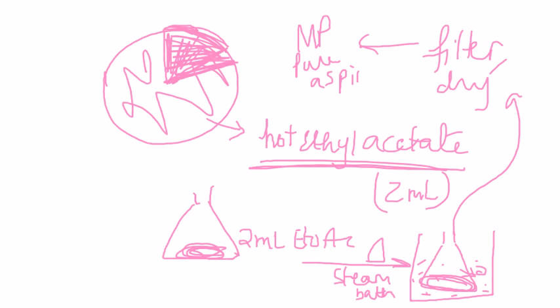You're going to take the melting point of this pure aspirin sample, and you would then be able to answer the post-lab questions, of course, in your own time. We will take an IR of this. I will provide you the IR of salicylic acid, but you will be taking the IR of your sample of aspirin, and you'll do the comparison, of course.